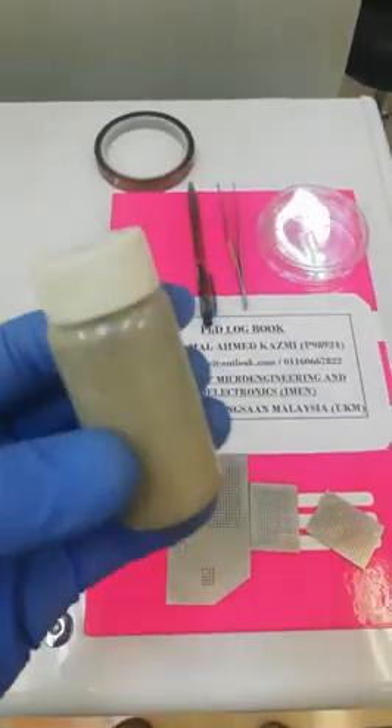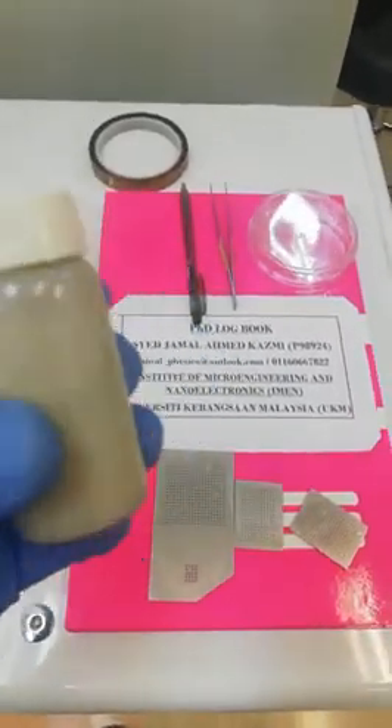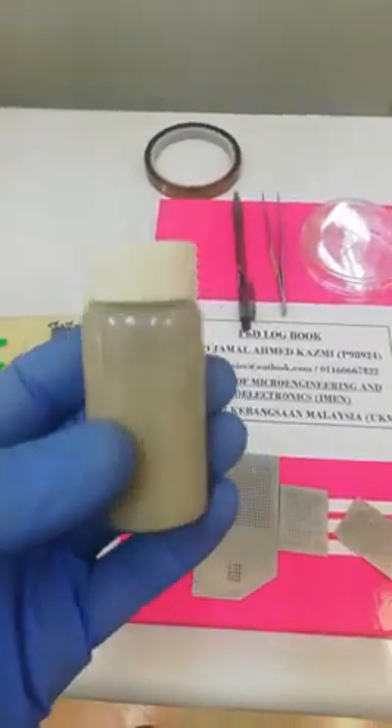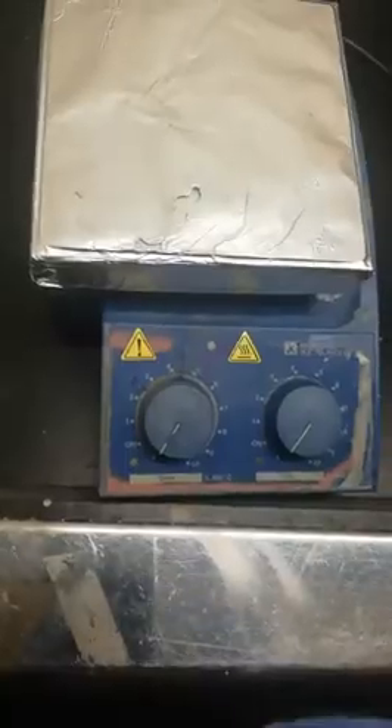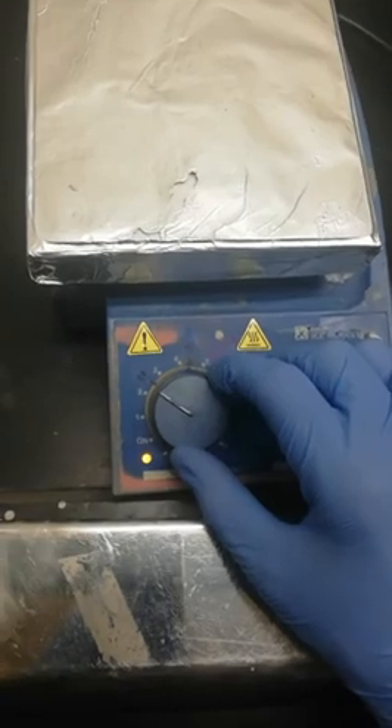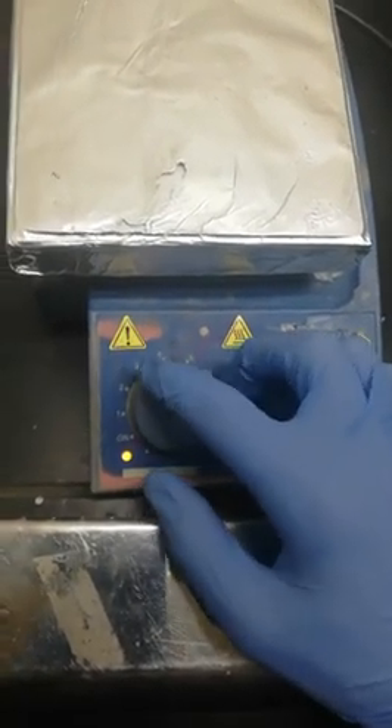These are silver nanowires made with a one-to-four ratio: one part silver nanowires and four parts IPA. We have to set the temperature of the hot plate to around 80 degrees. From my hot plate I can confirm this is 80 degrees.